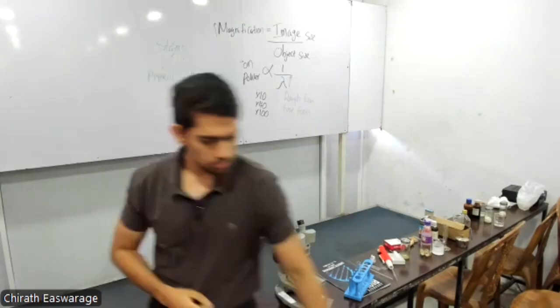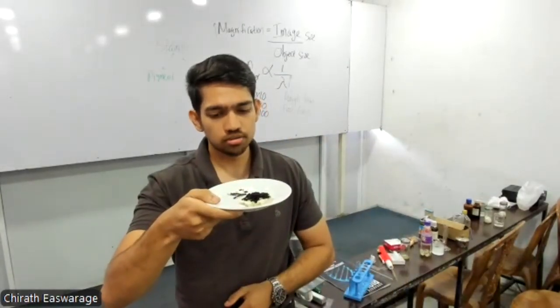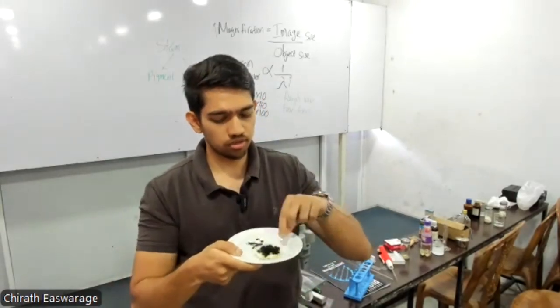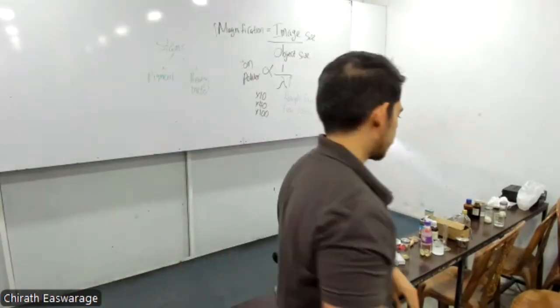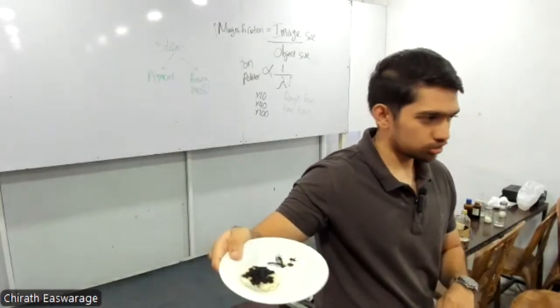And also this, another solid state of starch, wheat flour and also a slice of bread. We did the iodine test and got the same color change.